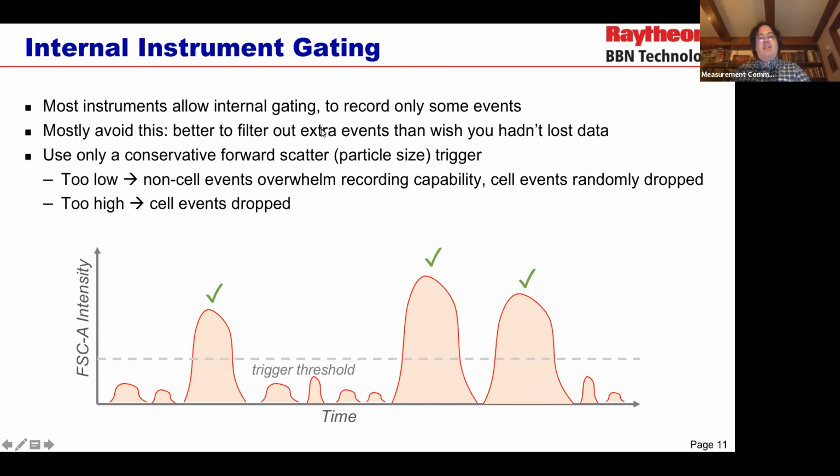And see, are there any especially interesting ways that machine learning or deep learning can be integrated with flow cytometry? I really can only just say yes. There's so much data, and people really haven't even explored that fully yet. I just recently saw a preprint from some colleagues of mine at NIST who are doing exactly this. And so this is something that I would encourage you to go and play with.